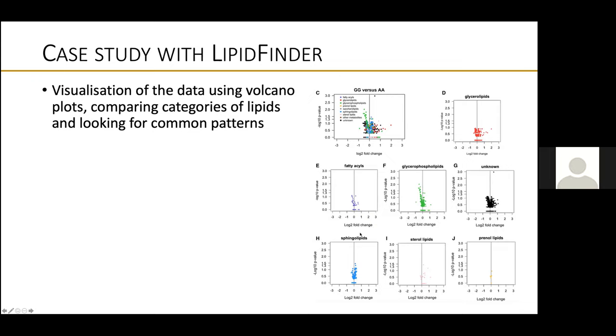And also because the programs using XCMS followed by LipidFinder try really hard to remove all of the spurious stuff, including things like in-source fragments, which may contribute to putative matches in many of these cases. It reduces the number of variables as much as possible, which also helps increase statistical power.